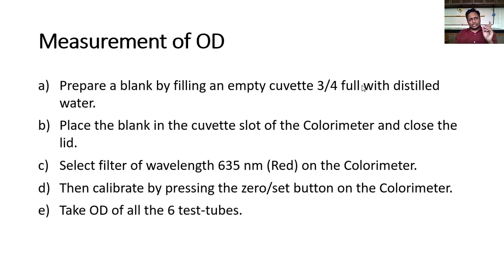After the test tubes are ready, prepare a blank by filling an empty cuvette 3/4 full with distilled water. Place the blank in the cuvette slot of the colorimeter and close the lid. This is zeroing of the colorimeter, water blanking the colorimeter. You have to select the filter of wavelength 635 nanometer. Blanking of colorimeter has to be done for each wavelength. You can't do blanking once and if you vary the wavelength, you again have to zero it for the particular session. Select the wavelength and then calibrate by pressing the zero button on the colorimeter.